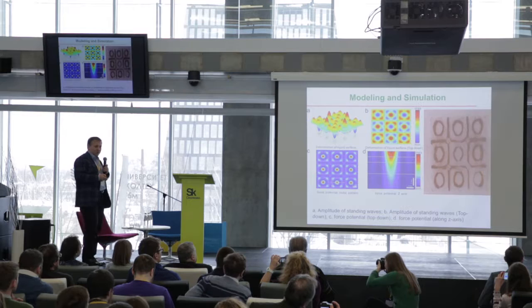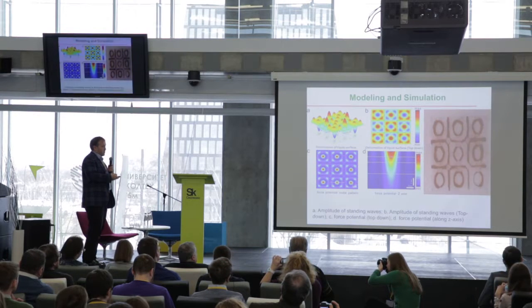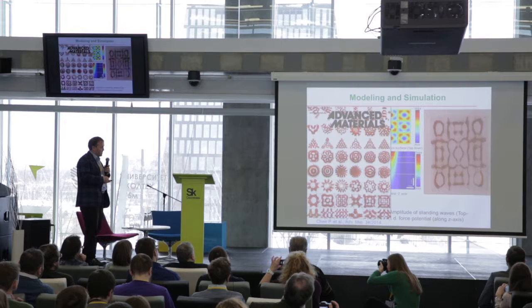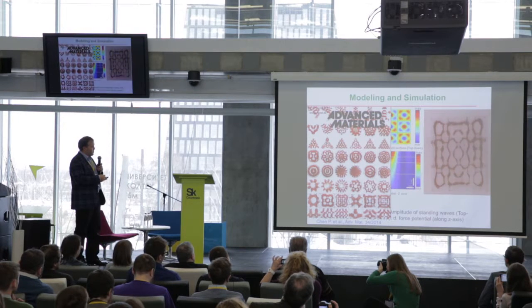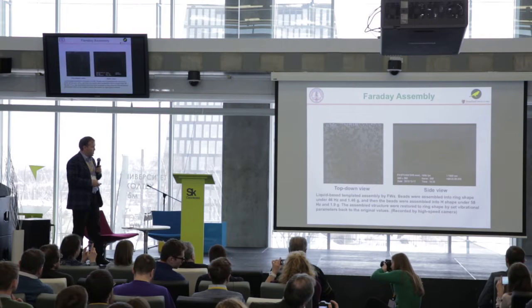There are two major forces here. One is the acoustic forces that move things, and the other is the capillary forces that hold the cells or spheroids together once they are close enough. That's something that we had published earlier. As you change the shape, like we tried heart shapes and circles, as you change the shape of the reservoir as well, you're actually able to form very complex shapes.